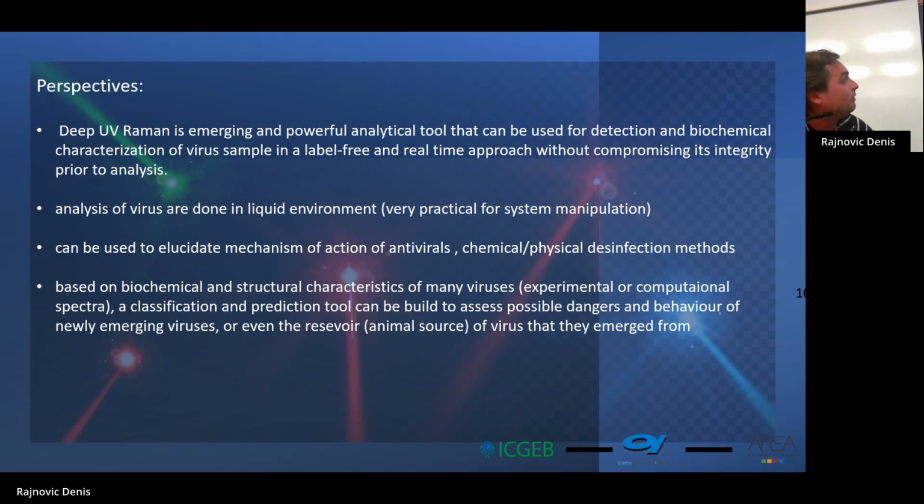It is emerging as a powerful analytic tool that can be used for detection and biochemical characterization of virus samples in a label-free and real-time approach, without compromising their integrity prior to analysis.